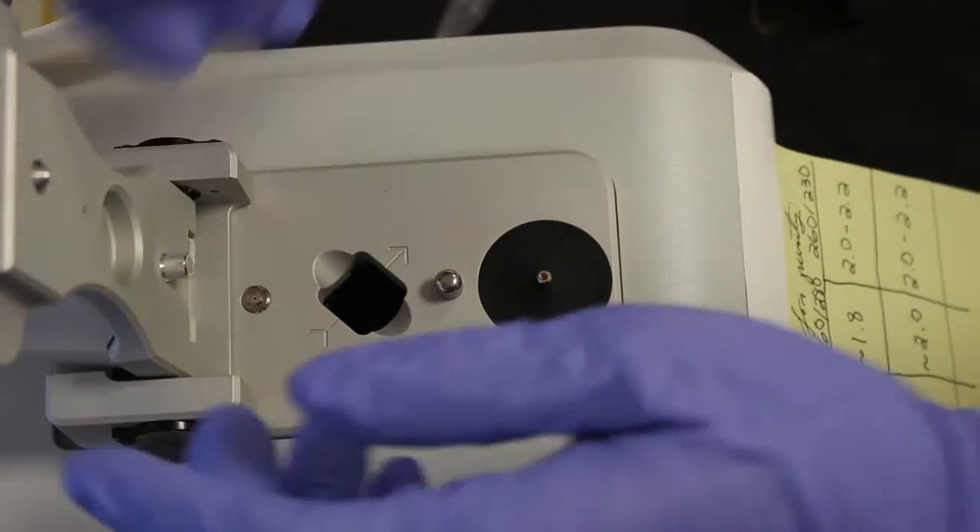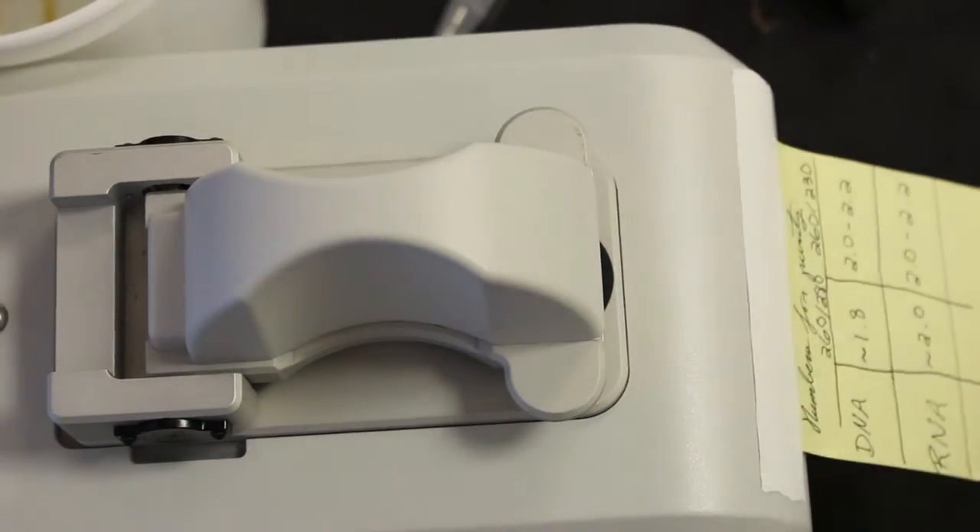Once the machine has been blanked, you can load 1 microliter of the sample, close the arm, and click measure on the program. The concentration should be displayed, as well as a purity curve.